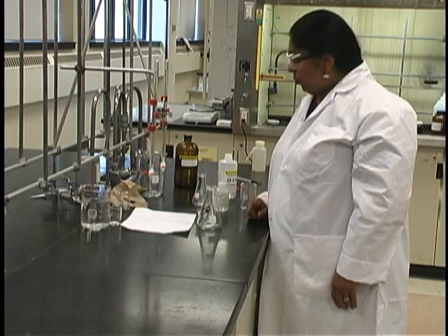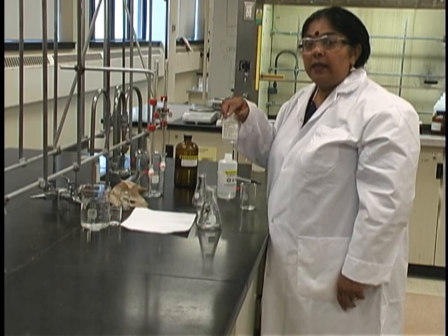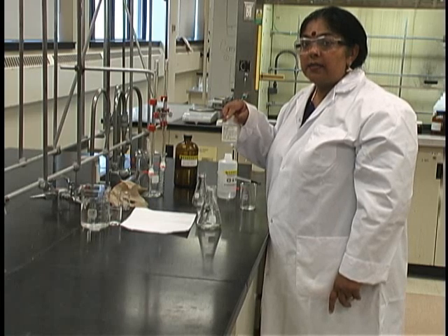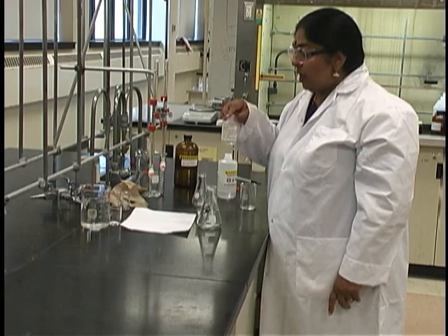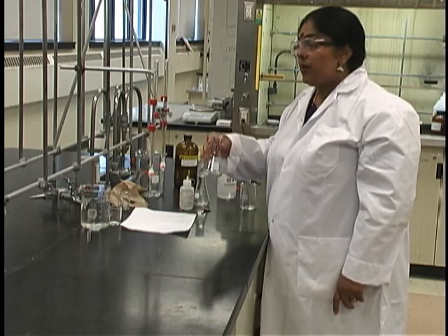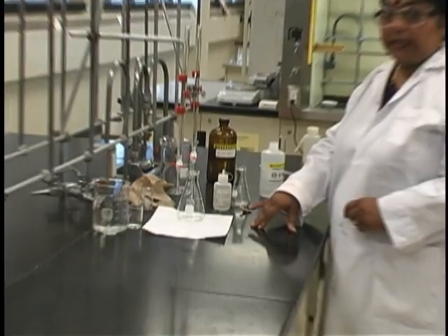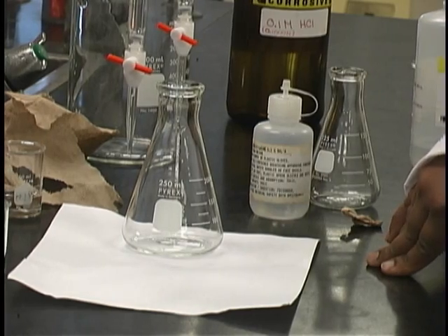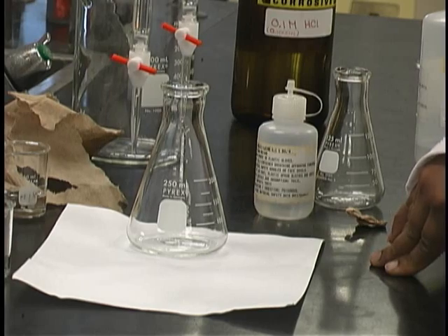For the titration, we will be using phenolphthalein as our indicator. Phenolphthalein is colourless in acid and bright pink in base. As the colourless to pink colour change is much easier to observe, we will place the acid in the Erlenmeyer flask and titrate the acid with the base. Place approximately 20 milliliters of your acid in the Erlenmeyer flask — it doesn't matter what volume you put in as long as you know exactly what the volume is.